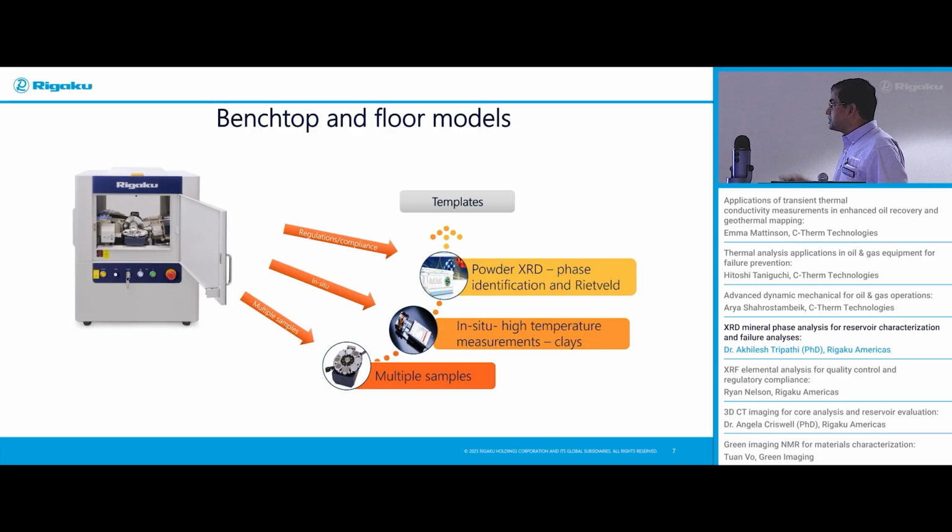All this, which is the way I lead to, can also be done using templates, which will allow you to analyze samples in bulk, a large number of samples, and also allow someone with less experience in this field to do it, because otherwise you need quite some experience to do quantitative analysis. That would be the major gain of going through templates.